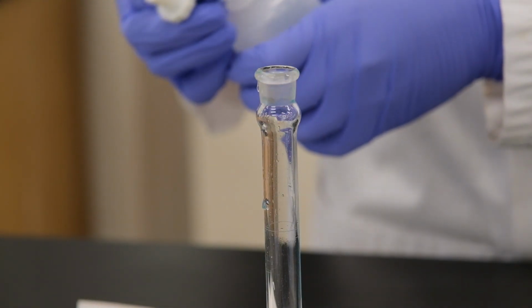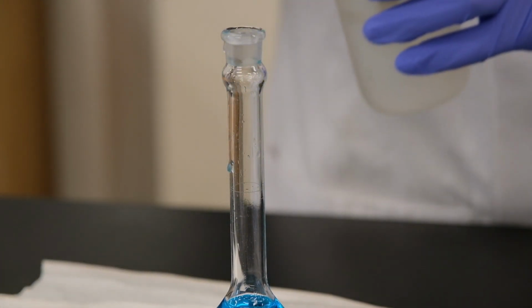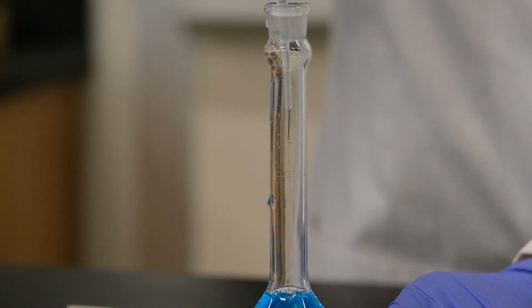And then once we start getting closer to the mark, we're going to be using a pipette until the meniscus is right across the line.